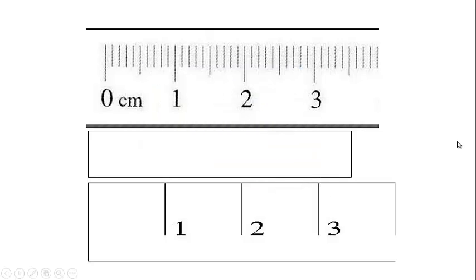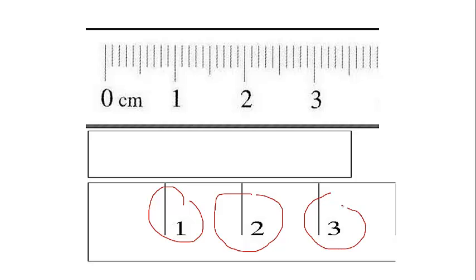Let's talk a little bit about how to properly measure. You will notice on this screen that there are two different types of rulers. Each instrument that we use, whether a ruler or a triple beam balance or a graduated cylinder, all has a limitation. And the limitation is basically whatever markings are on the instrument. So for example, down here at the bottom, you can see that the only markings on here, the smallest markings, are our centimeter markings.